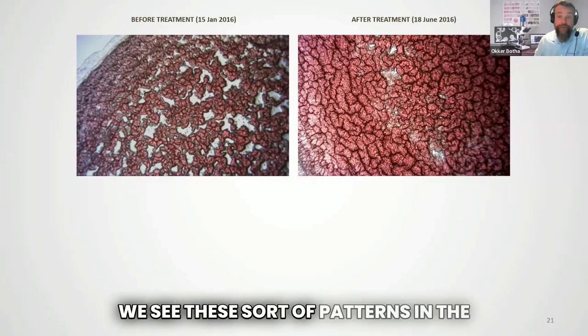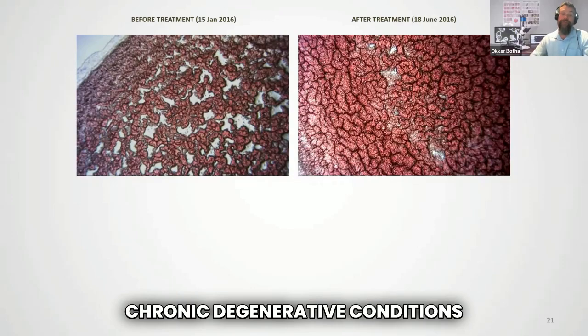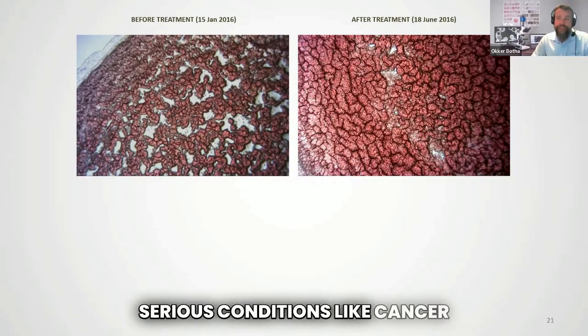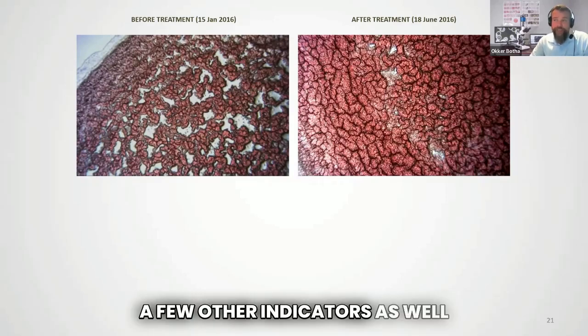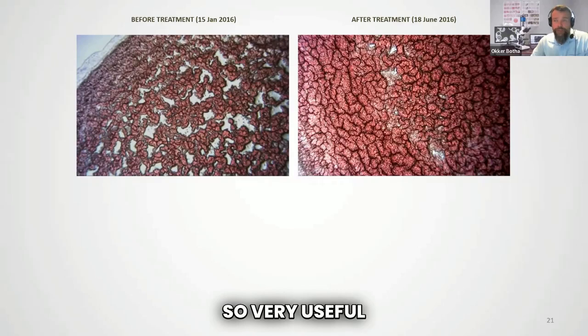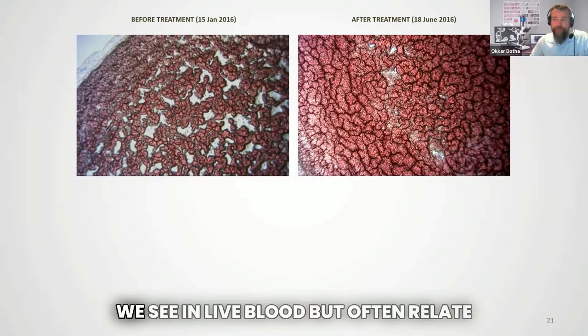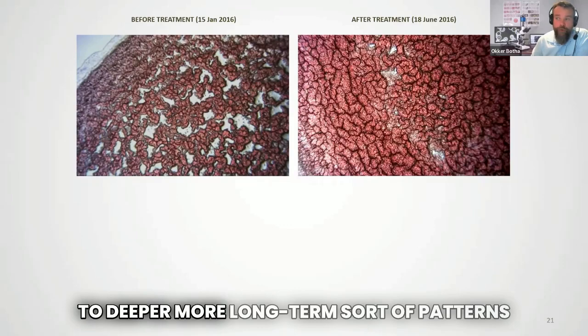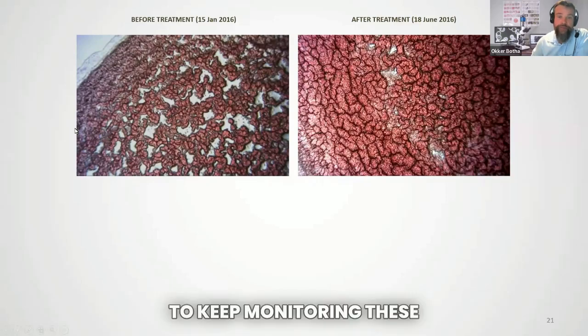We see these sort of patterns in the dry blood sample of patients with more serious chronic degenerative conditions, serious conditions like cancer. We also see these patterns along with a few other indicators as well. So very useful, the patterns that we see in dry blood correspond to things that we see in live blood, but often relate to deeper, more long-term sort of patterns.